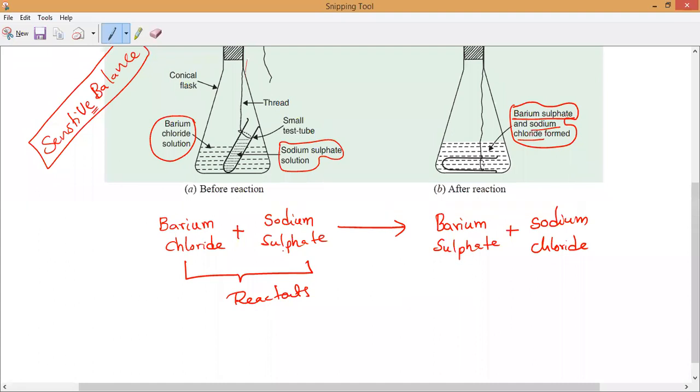So how to verify it? Let us take the values, which I have also given. Can you tell me what is mentioned here? Observe here and tell me. Barium chloride, what is the state? A solid, liquid or gas, or is it a solution? Everybody, see it here. Solution. That is very important.